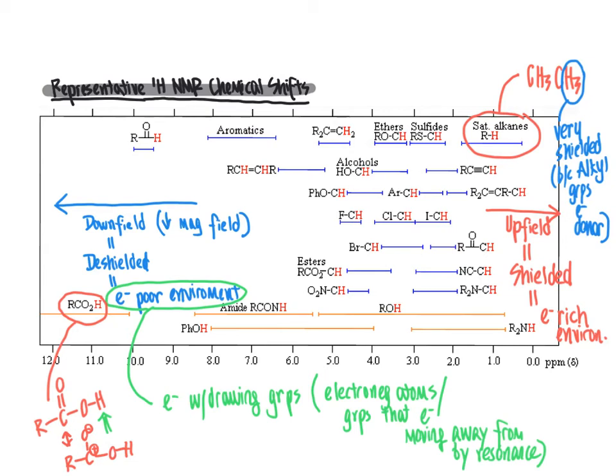So in many of these cases, you will see multiple protons within the structure. For example, in the alcohol here that I'm circling, kind of in the middle of the page toward 4 ppm or so, if we follow that down, you will see HOCH, the particular hydrogen atom that we are measuring as having a chemical shift in that region is the one that is in red here.